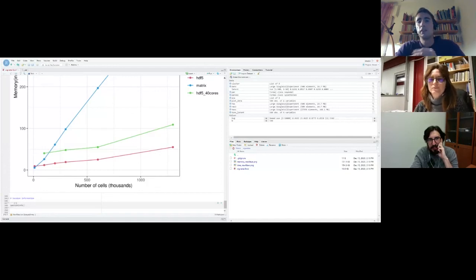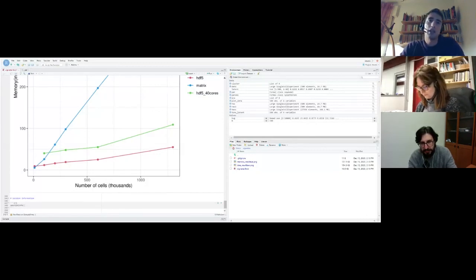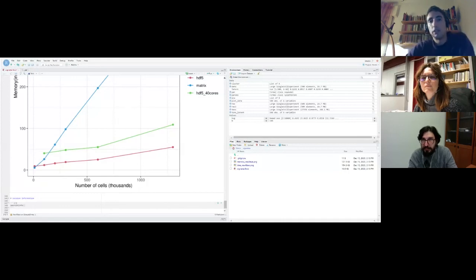Yes, the main difference is that NewWave assumes a negative binomial instead of a zero-inflated negative binomial. And even more, there is the way we parallelize the process, because ZinbWave uses BiocParallel, while we use a PSOCK cluster with the shared-memory package that, as I said in the beginning, allows us to share some matrices between cores, and that avoids the increase in memory consumption.